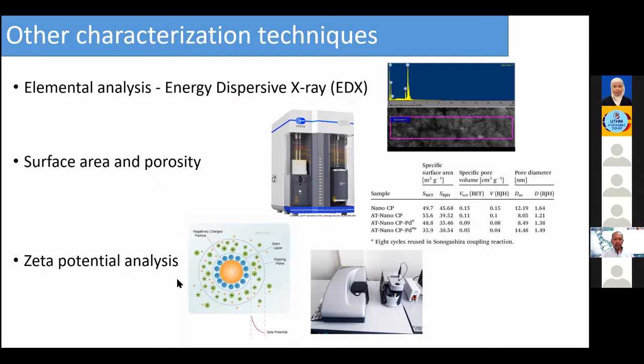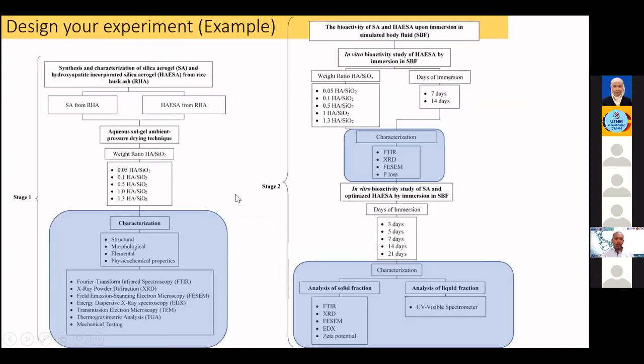Then zeta potential analysis, the charge of the sample, the charge of the material, whether it's positive or negative. Actually, there are many characterization techniques that you can do. It's based on your material, your application, and also the available facility in your lab.